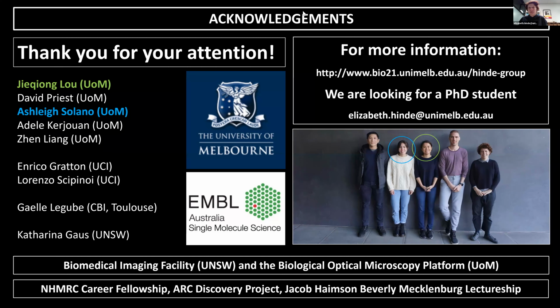Cool. There's a question by Ken Davidovich. I'm gonna unmute him so you can ask his question. Yeah. So can you comment about the spatial resolution? How many nucleosomes you have per pixel in this FFS analysis?